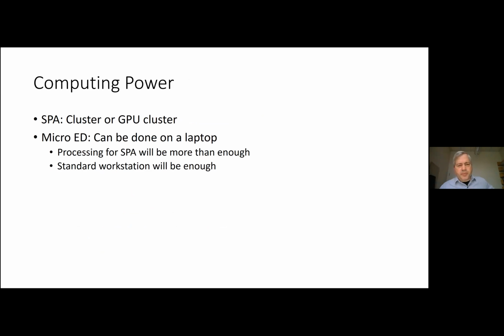In terms of computing power, for single particle you generally need a cluster or a GPU cluster, or something with at least 4 good GPUs and a lot of memory and a lot of disk space. MicroED can actually be done on a laptop. I went to the first MicroED course, in 2015, I think it was. We basically brought a laptop and they gave us a Linux boot disk, which had all of the software on it.